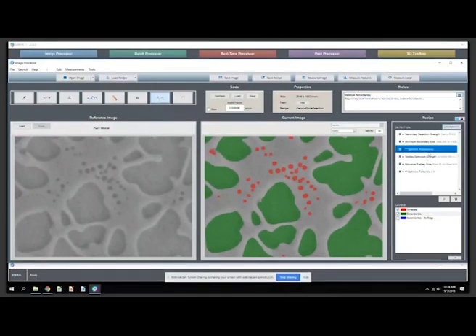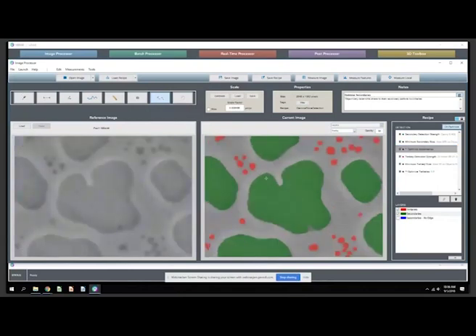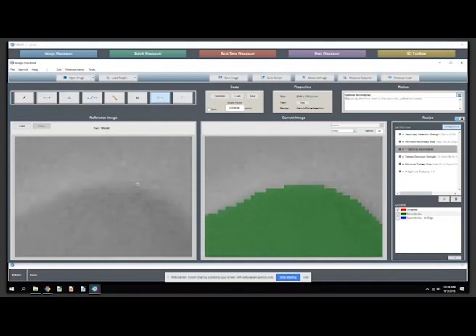And what I then want to hit on are these two optimization steps, because as anyone who's been around image analysis knows, just because you're using a computer, it doesn't take away the subjectivity of it. You could add a growth step that grows the particles by a pixel or two, and you'd still be hard pressed to decide exactly where to draw this boundary. Do I bump it out a pixel? Do I shrink it by one? There's always a gradient, as you can see at this high zoom level. So where do you stop?